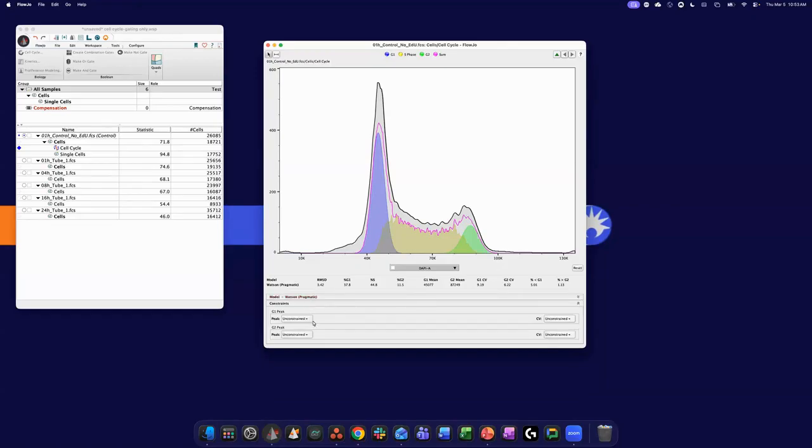Now, let's say I'm unhappy with the unconstrained model. I feel like there's room for improvement. What are some ways we can start constraining the model? Here you can see everything is unconstrained, so I'm basically letting the model just do its best to fit the data.